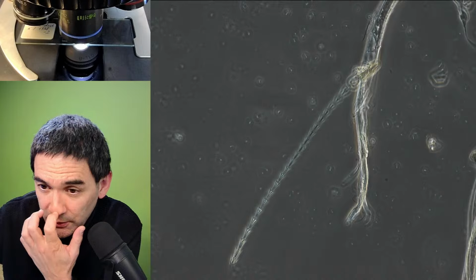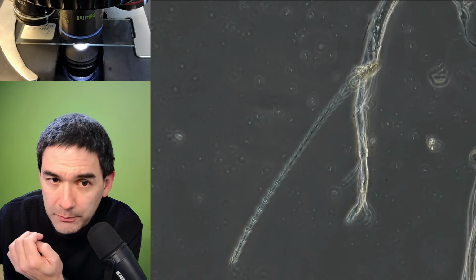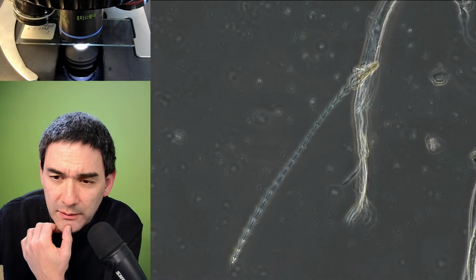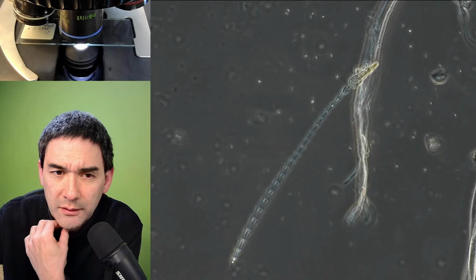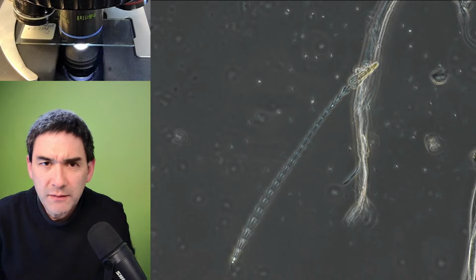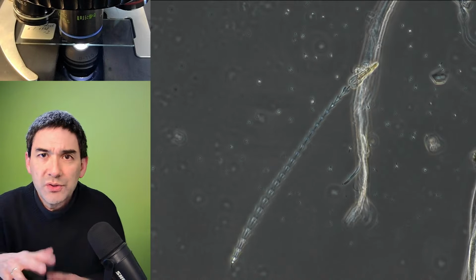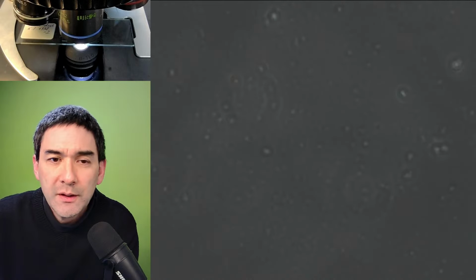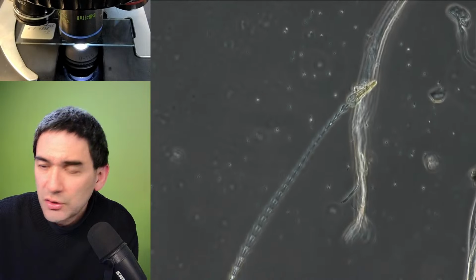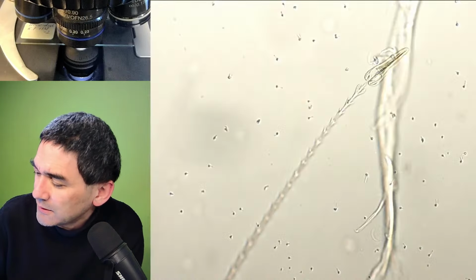Chitin is not a protein. I think it's a polysaccharide. But I wouldn't be surprised if there are certain proteins included in there as well. So I bumped it. Let's go up yet higher. 60 times.